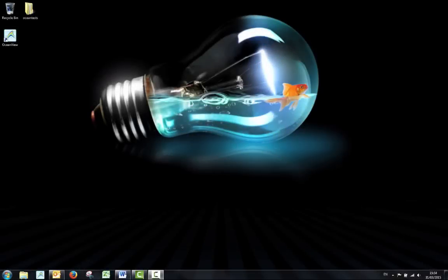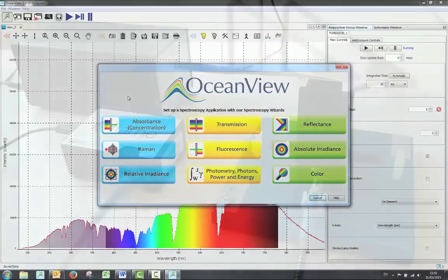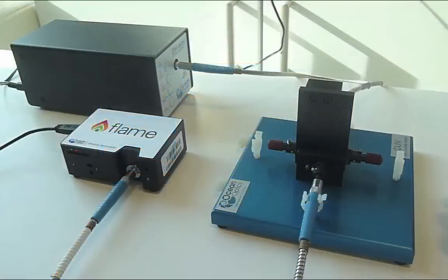This video is going to demonstrate how to set up and take absorbance measurements, showing you the simple way to use OceanView software and an example setup of OceanOptics equipment.